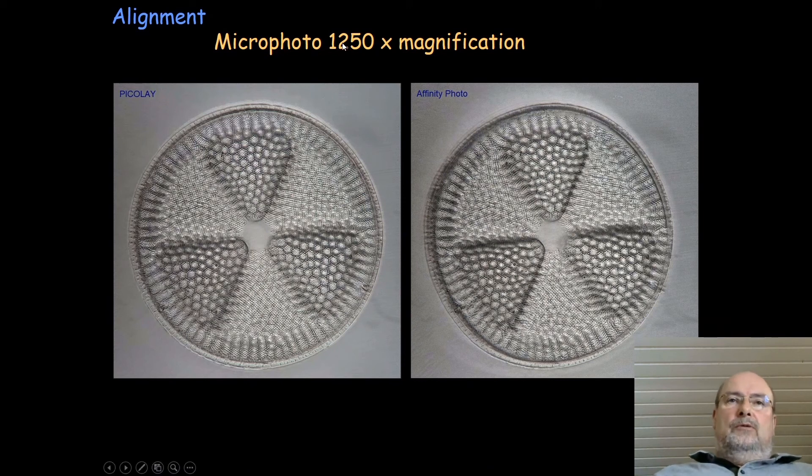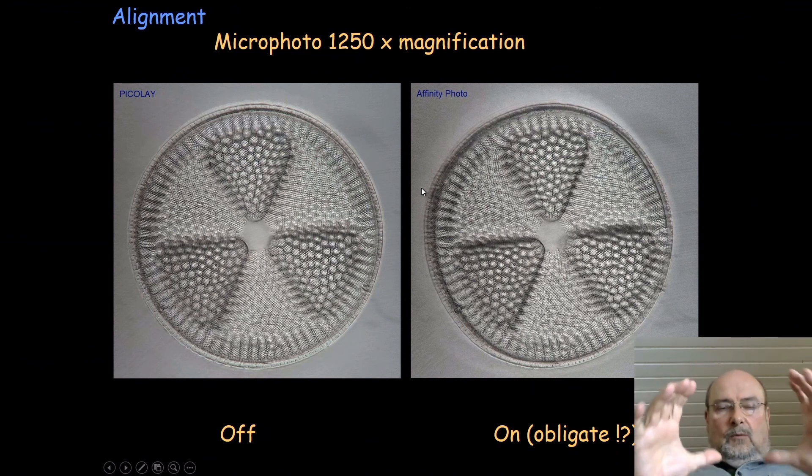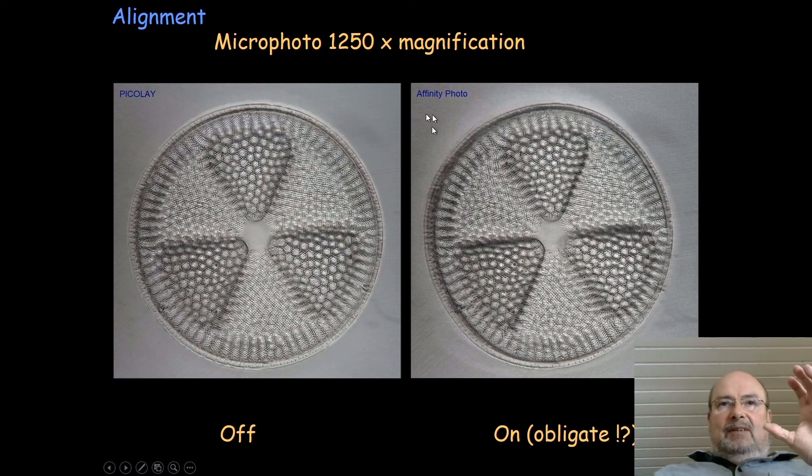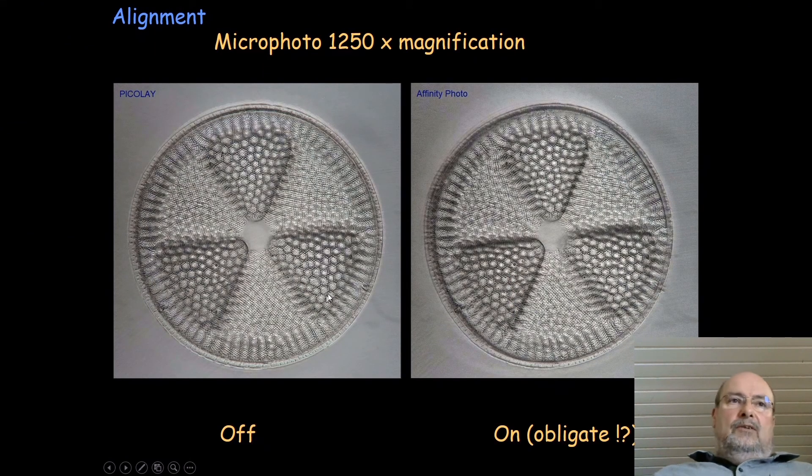I have another example here: a micro photo with a hundredfold objective. You see a Picolet image here on the left, there's no alignment in this case. Here is a stack done with the same images with Affinity Photo. Unfortunately one cannot switch off the alignment in this program. You see the quality of the result is much worse because there are halos and shadows wandering when you're going through the stack. Affinity Photo tries to compensate for that and then you see here the structures are lost, here is an additional thing coming up. It's not really sharp anymore. So in this case it's better to avoid the alignment, definitely.